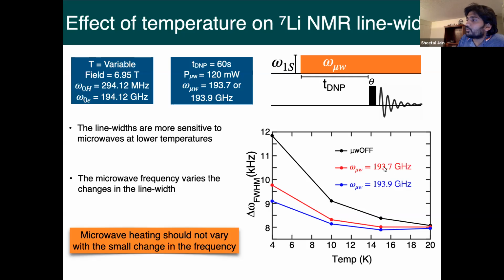And we are changing the frequency only by 200 megahertz, and even by that small change, the line width is significantly changed. So it doesn't seem like it's a heating effect, because heating should not depend that much on the microwave frequency, especially when it's only 200 megahertz away.